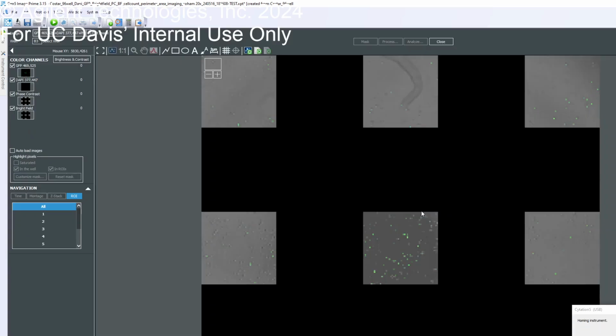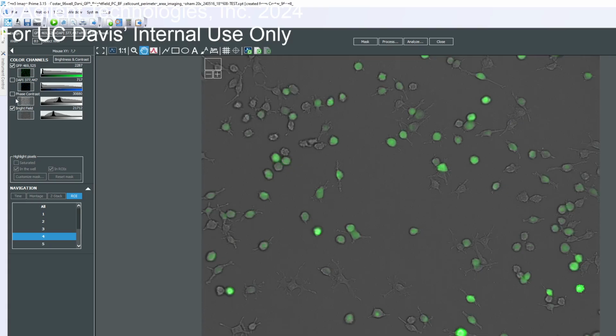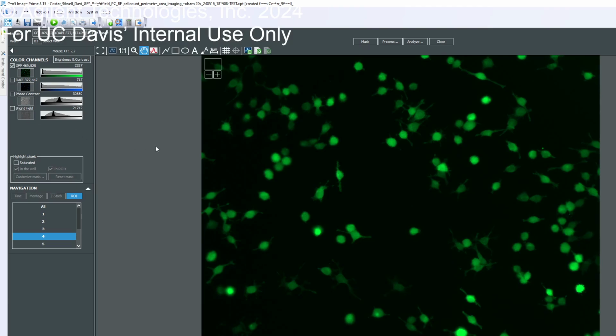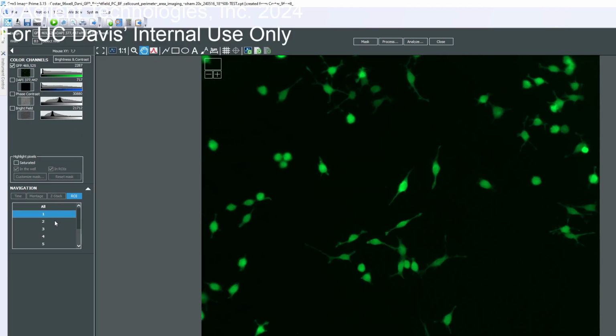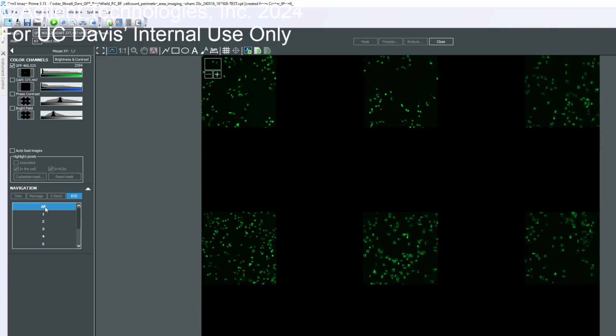Oops, it's almost at the end. So now this is how you would see the beacons options. You see all the 9 FOVs. You can go into any of them once the homing is done and look at the morphology and all the channels and everything. So it's quite nice. It gives you much more data to work with. And you can also see all of them together.